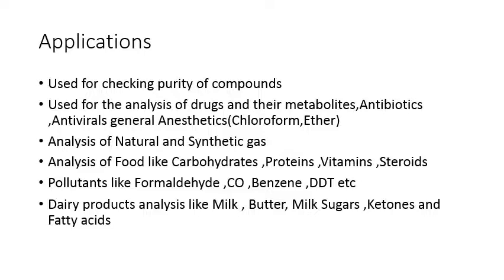Now the last topic, the applications of gas chromatography. It is used for checking the purity of compounds, whether the sample is pure or impure. To check the impurity, we relate it with standard samples, highly pure samples, and on that basis we can check the purity of the compounds. It is used to analyze various drugs and their metabolites, antibiotics, antivirals, general anesthetics, chloroform, ether.